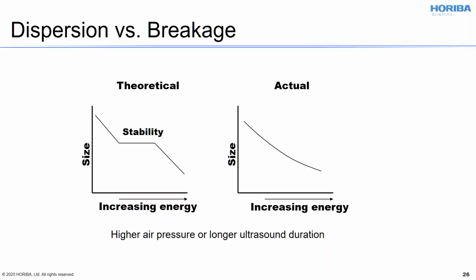The reason you see these soft plots of size versus energy is that even though you're breaking up some agglomerates, you are also going to be breaking particles as well. Tougher materials like ceramics tend to have fewer problems with this issue than something soft. A famous example of a soft material is milk powder or a lot of agricultural types of goods.